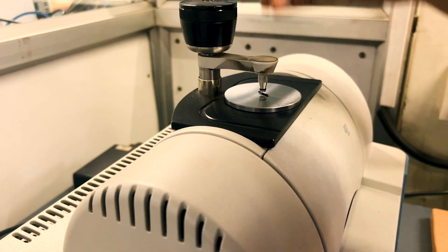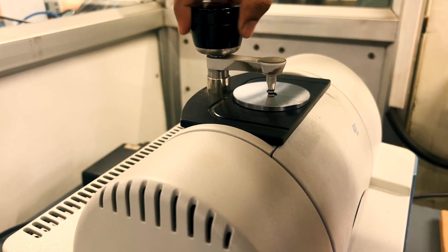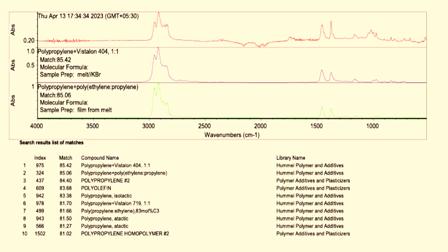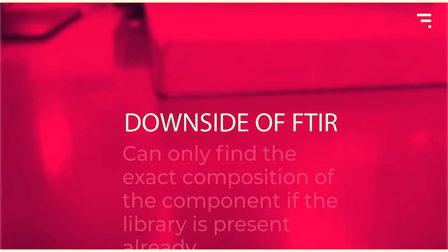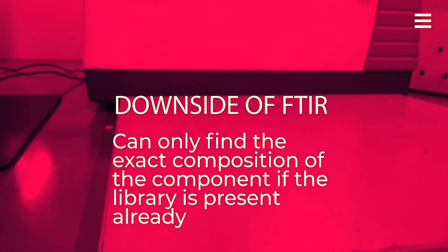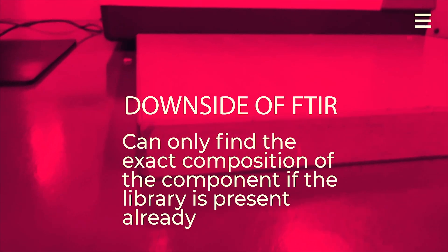Next, we're going to look at this car dashboard material. Just like before, we cut a portion of the sample and place it under the instrument. The spectrum shows the sample is made up of polypropylene combined with polyethylene. The downside is that we cannot find the exact composition of polypropylene mixed with polyethylene unless that specific combination is already present in our library.